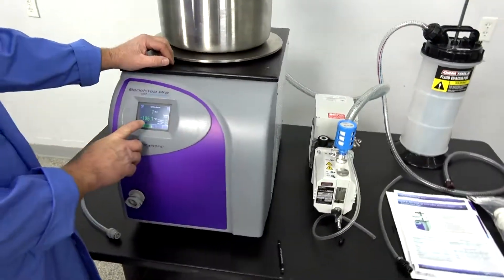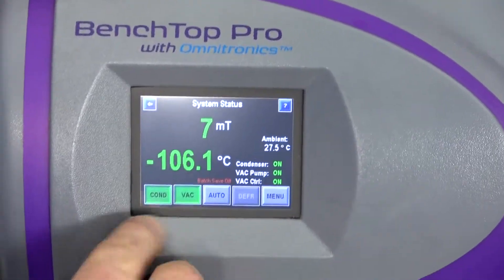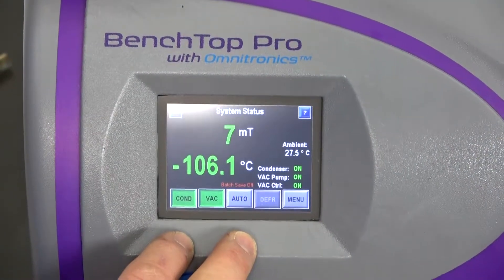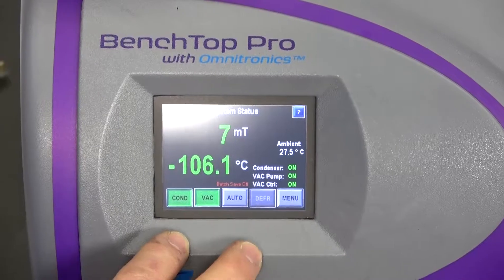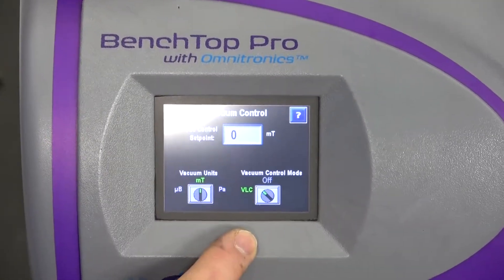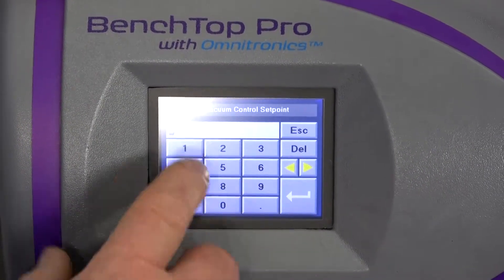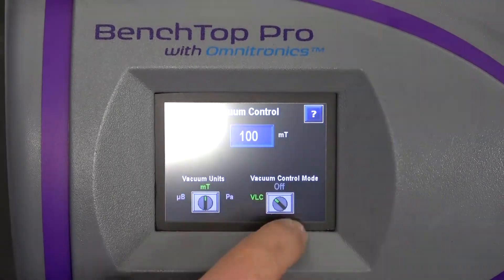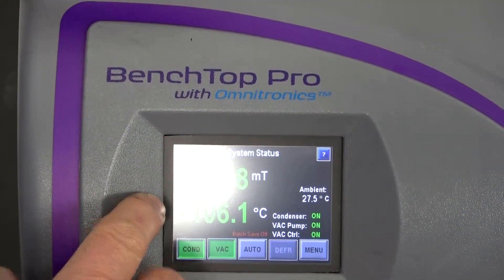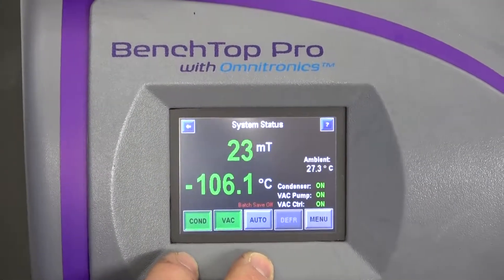Over on the screen you can see we've had this running for quite a while, but it's actually exceeding the manufacturer's specifications — it's down to negative 106 Celsius and it's down to 7 millitorr, so just an extremely well-working machine. It has a simple push-button screen; you can go into the vacuum controls and reset the vacuum. If I want to run at 100, I can hit enter, set it to 100, and it'll start rising the vacuum up until it hits that 100 mark and maintain it.